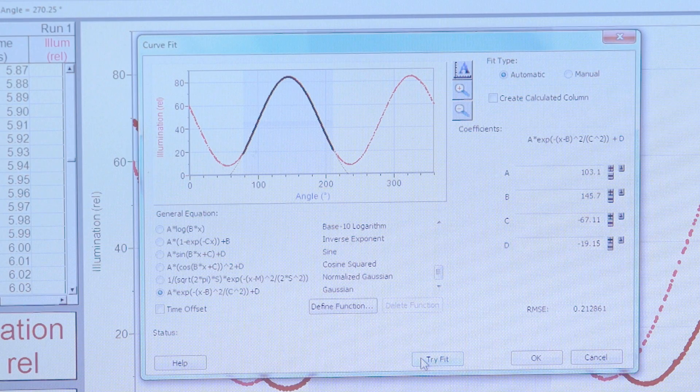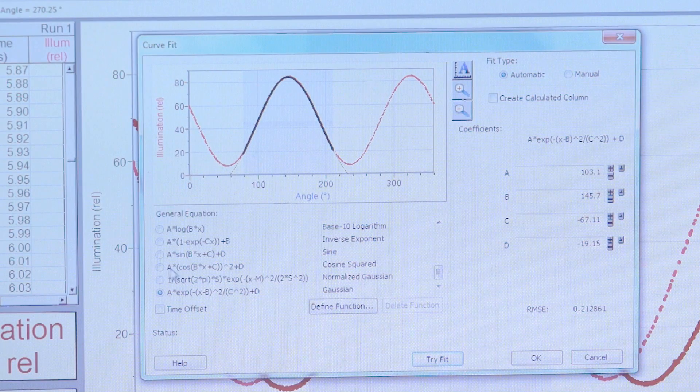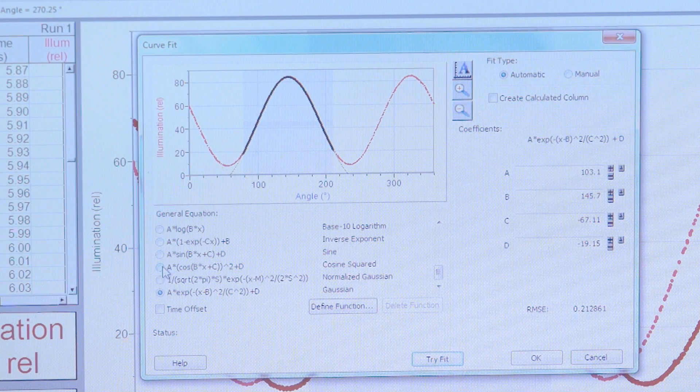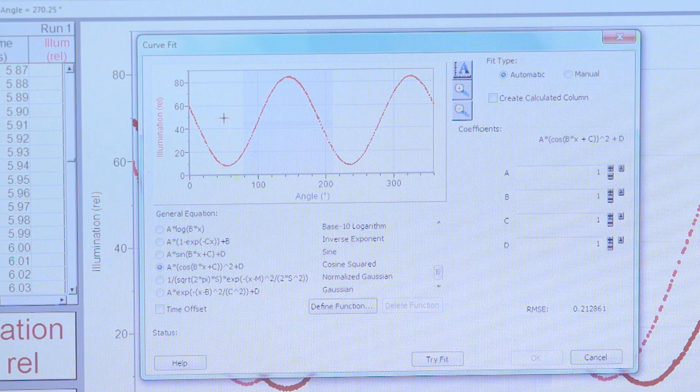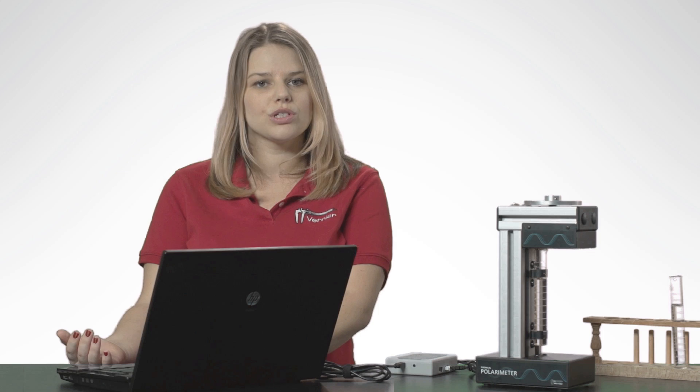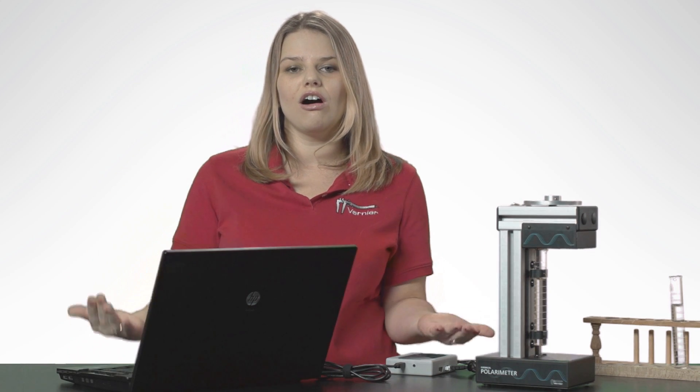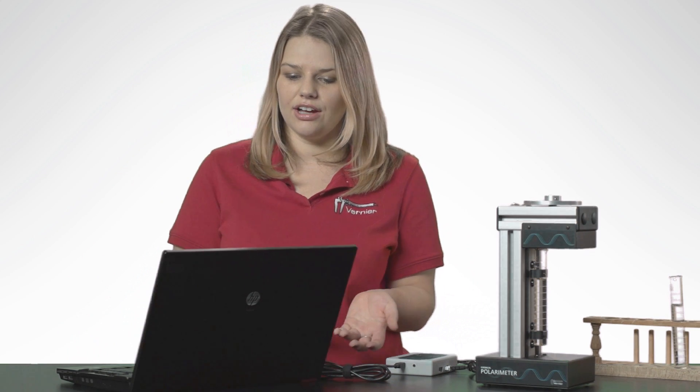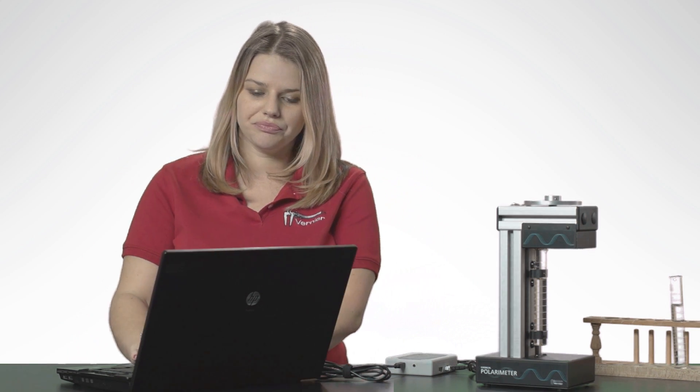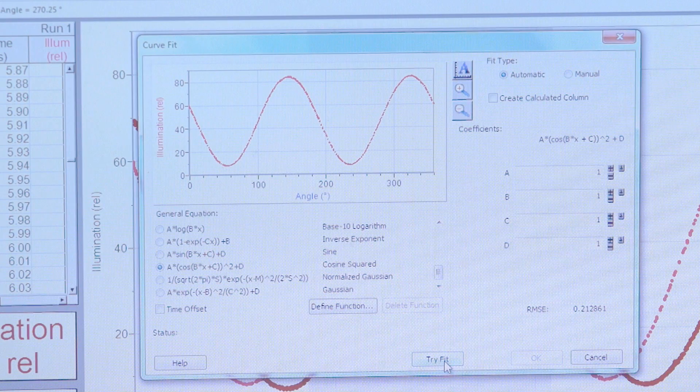So to do a cosine squared fit, simply select the cosine squared fit equation from the menu. Now make sure you deselect any region in the graph that's been selected, because the cosine squared fit takes into account all the data you've collected. And that's why it's the most accurate interpretation of your data. Select Try Fit.